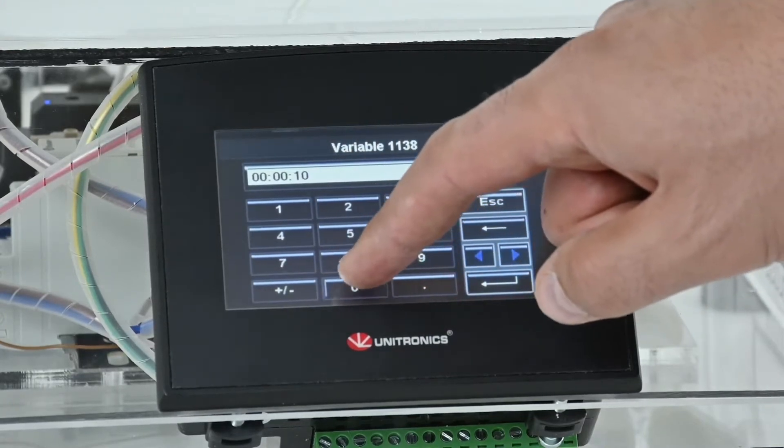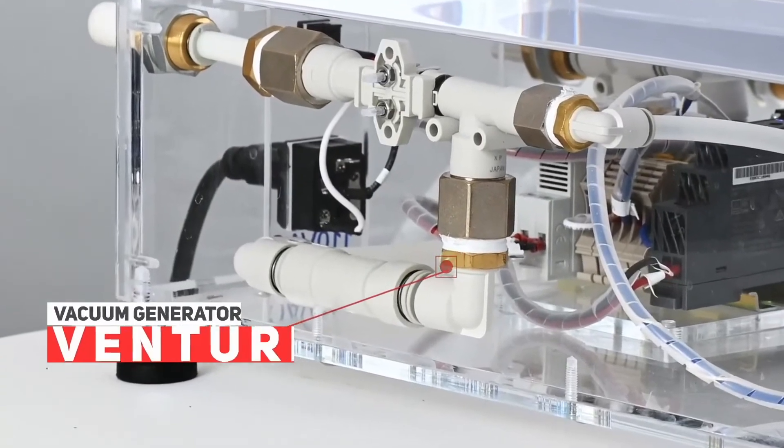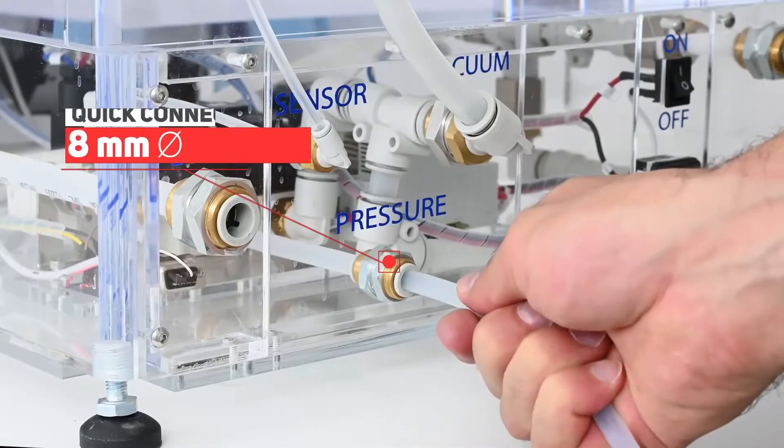The regulation of the vacuum level is automatic and is generated by means of a venturi system or an electric vacuum pump.